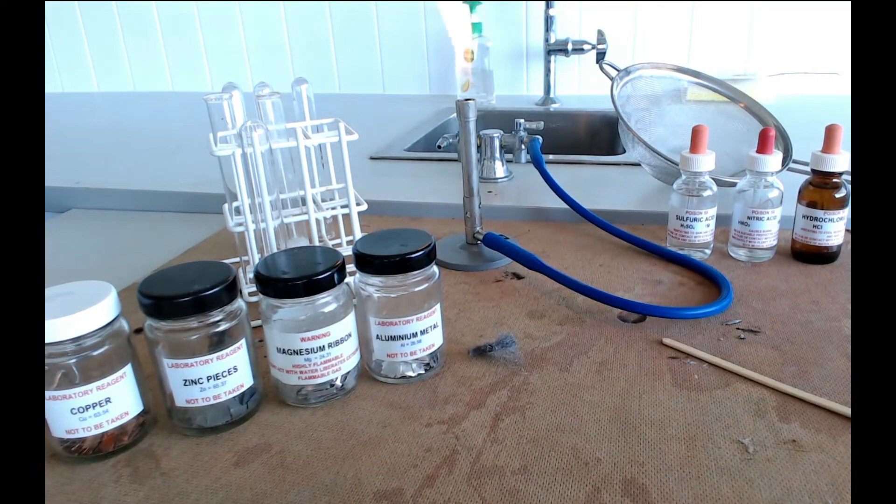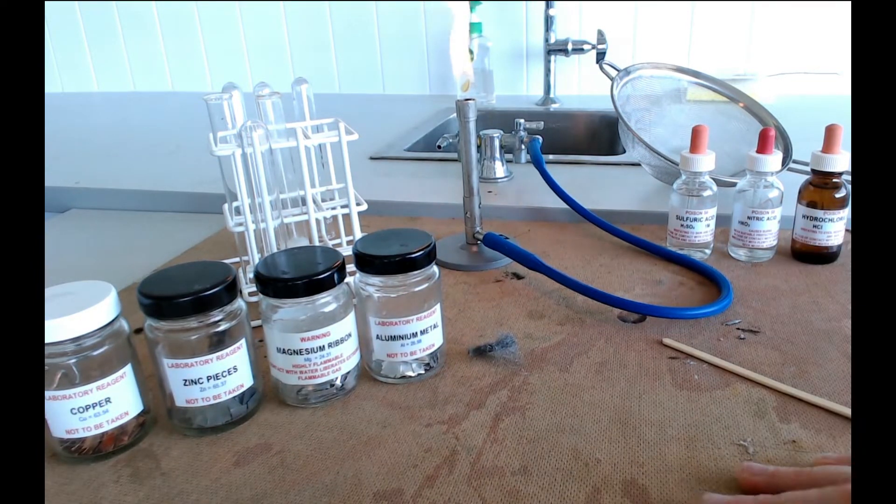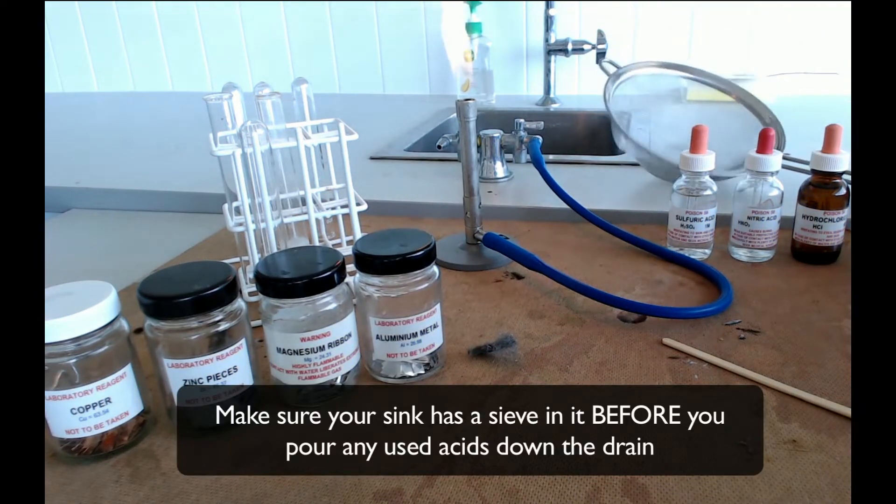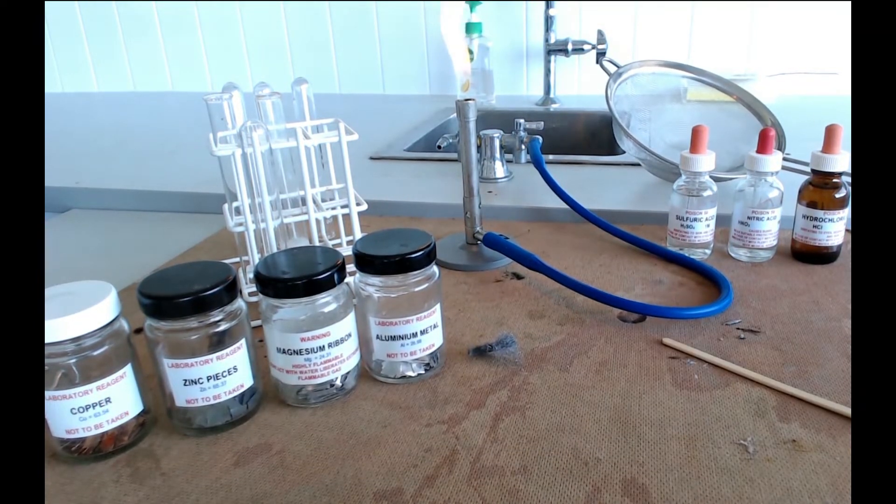And then the last two bits of equipment that we need are really just to keep things safe and tidy. We've got a heat mat here for when we're burning things. And we've got a sieve, and that's there so that when we empty our test tubes down the sink we can catch any unreacted pieces of metal.